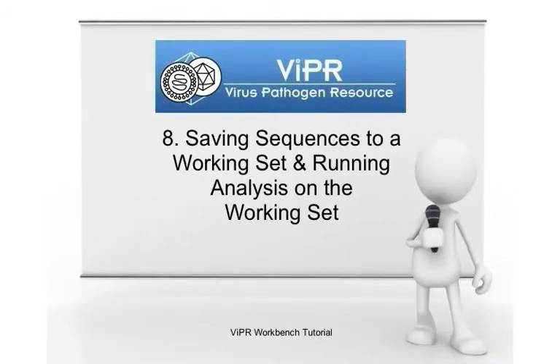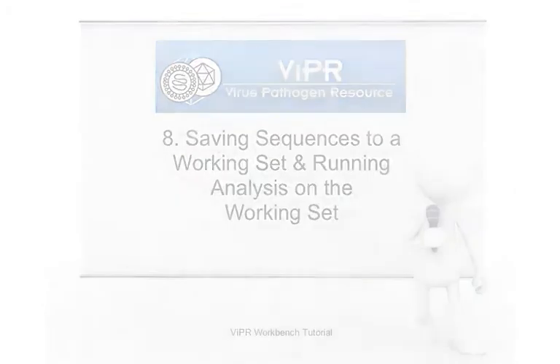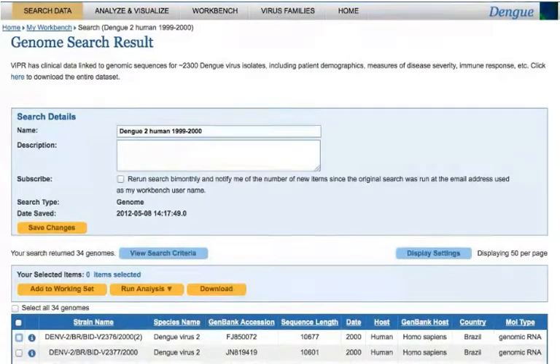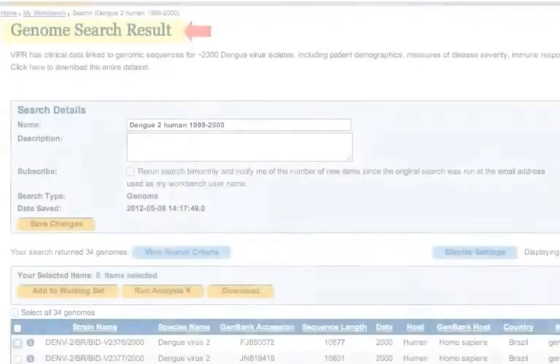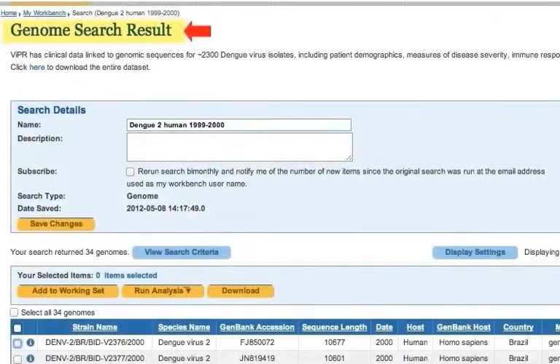Let's imagine that you would like to perform multiple analyses on some or all of the results that appeared in your search. You can save the specific items as a working set, and then run the desired analysis on the working set without having to first run the query before beginning each individual analysis.